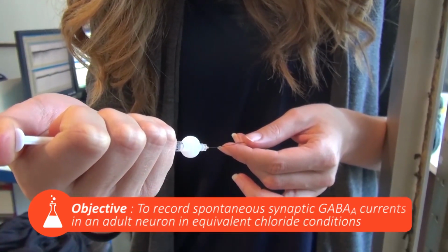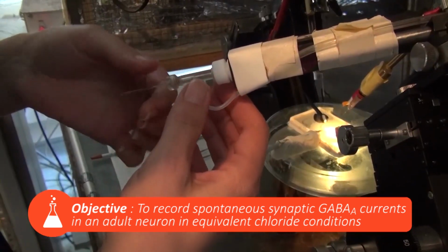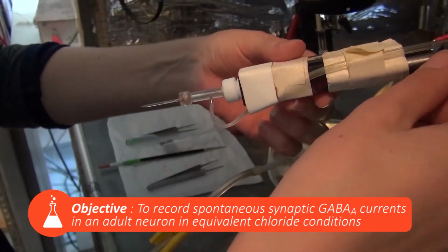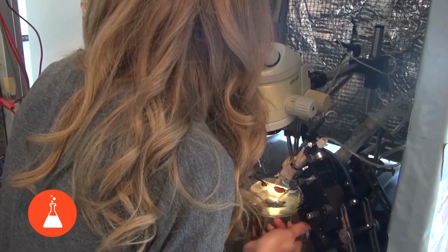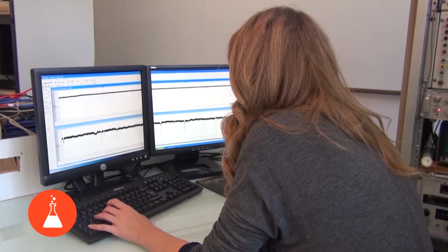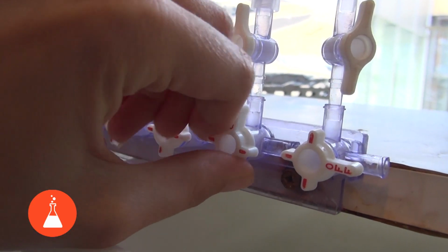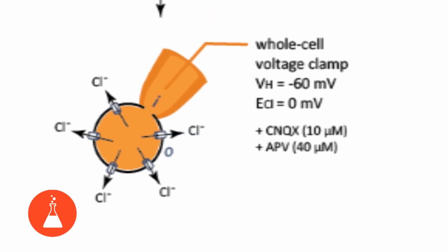The object of this experiment is to record spontaneous synaptic GABA-A currents in an adult neuron. This helps us understand the activity of the GABA-A synapses afferent to the neuron being recorded. To record only GABA-A synaptic activity, I add AMPA and NMDA-type glutamate synaptic blockers CNQX and APV to the extracellular environment. I record in whole cell configuration and in voltage clamp mode.